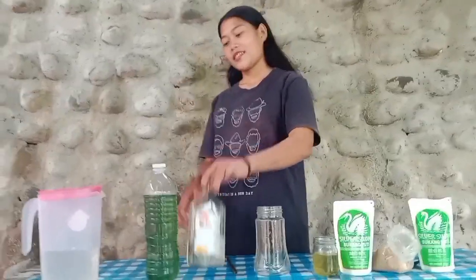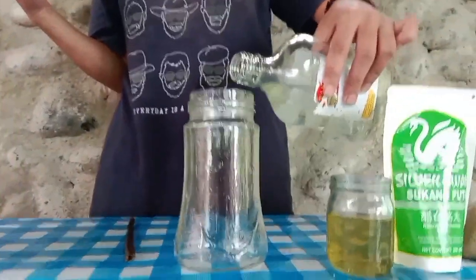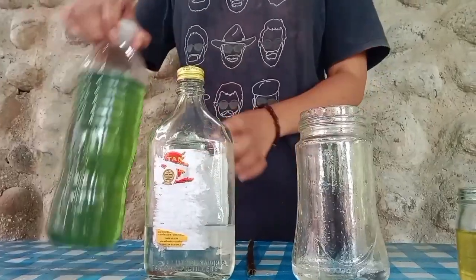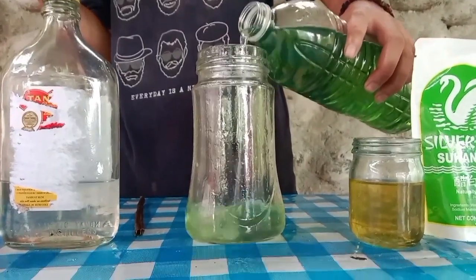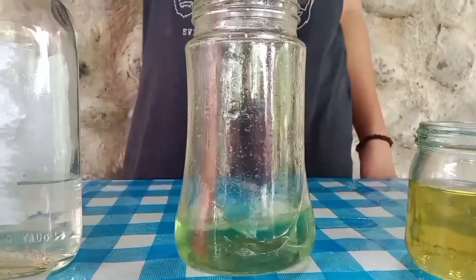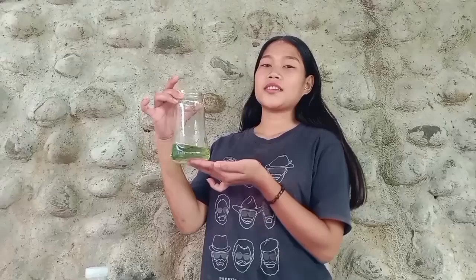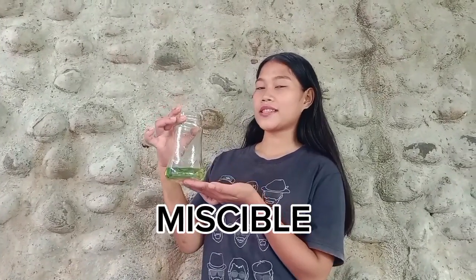Okay, next experiment is kerosene and gasoline. First is kerosene. Second is gasoline. So as we observed, they mix together because they are both non-polar molecules. So they are miscible.